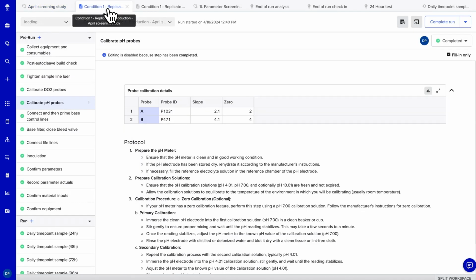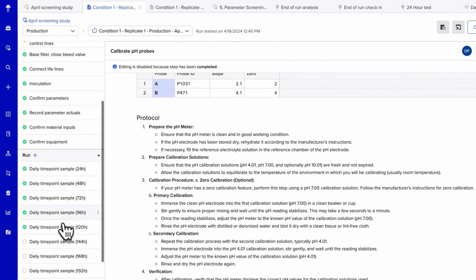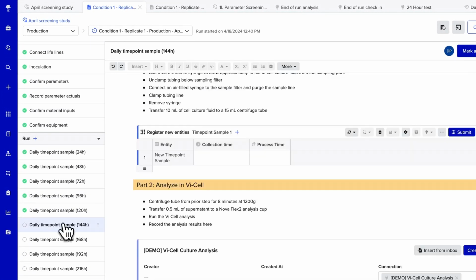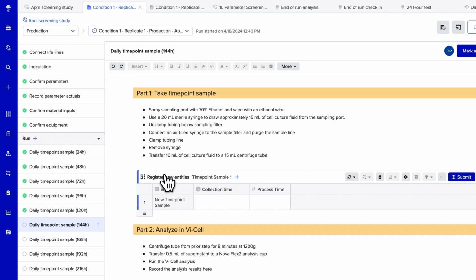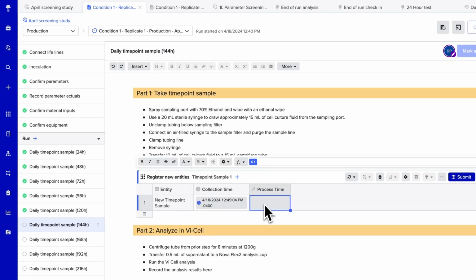By this point, there are likely to be multiple scientists and operators involved, and this interface helps everyone collaborate with full visibility throughout the runs. Because this recipe is broken up into smaller steps, different people can work on different steps in the same batch record. Online and at-line data is captured at each step.